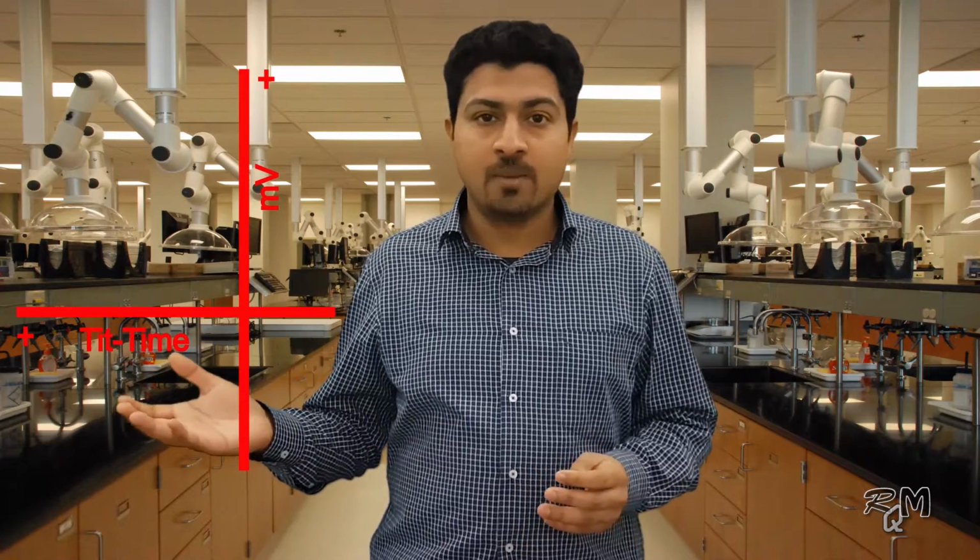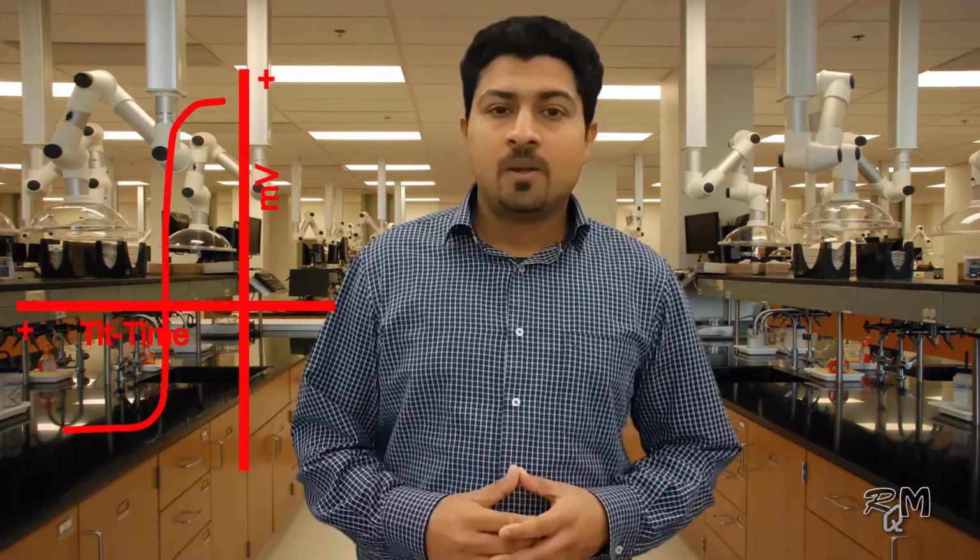So I think you're confused. Don't worry, I will explain it through a 2D graph. I will draw a graph between millivolt reading and titration time. On the y-axis, I will keep millivolt, and on the x-axis, I will keep titration time. Now, if you draw a graph between millivolt and titration time, you will get a graph something like this.